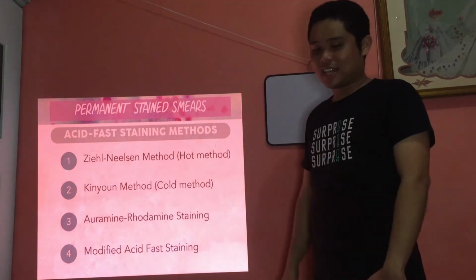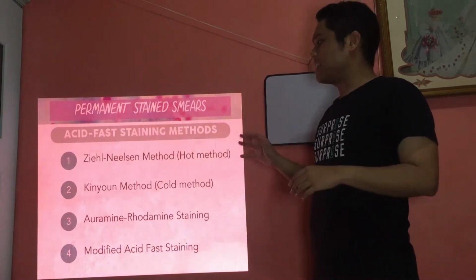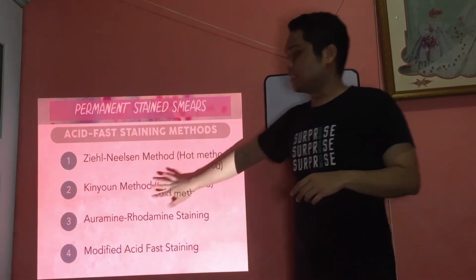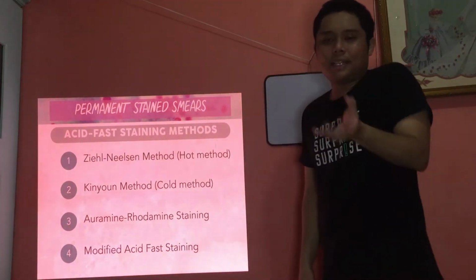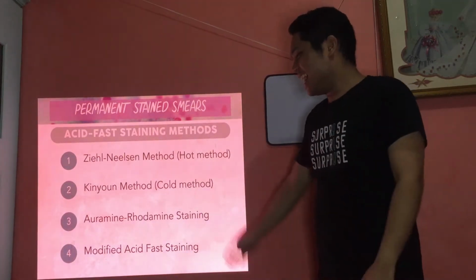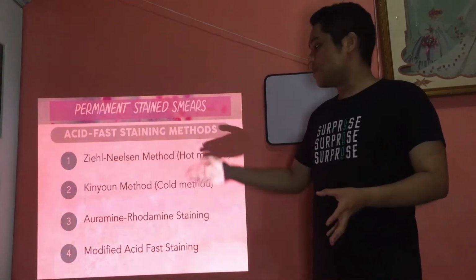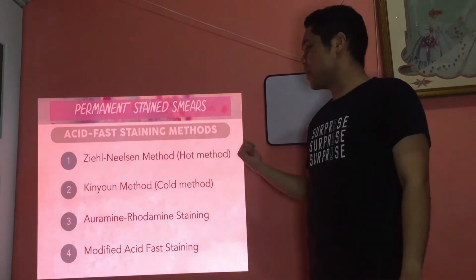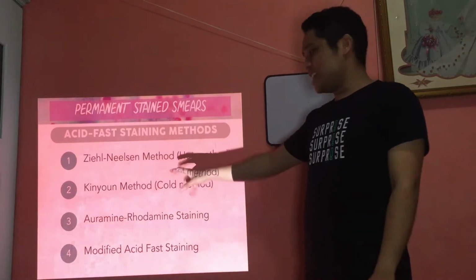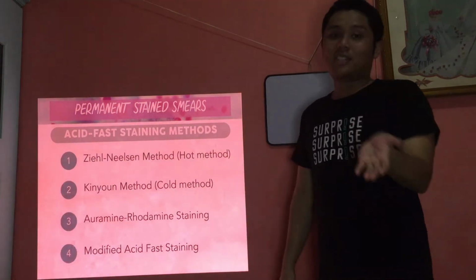Sorry, I'll just edit that. These are the methods, but what we're going to discuss are the first 2 and not this one. Because I'll reserve that for bacteriology, so that there's at least a little thrill. And then modified acid-fast. So these are the different methods for acid-fast staining. You have the hot method, the Ziehl-Neelsen method, the cold method, the Kinyoun method, your auramine-rhodamine staining, and your modified acid-fast staining.